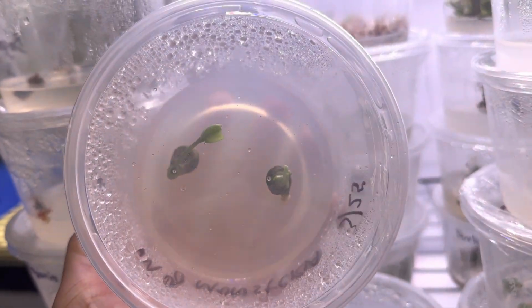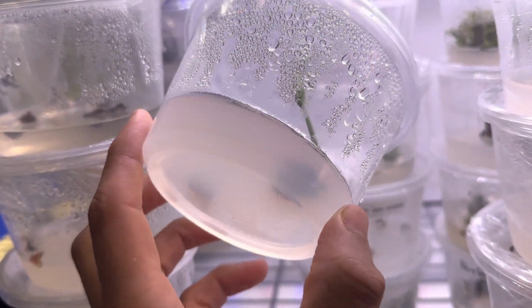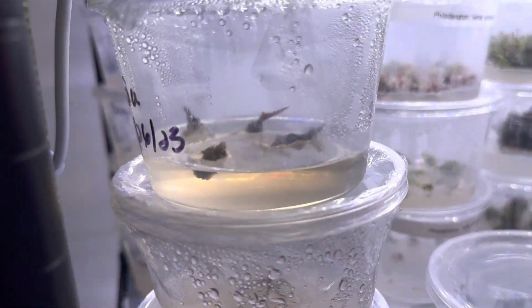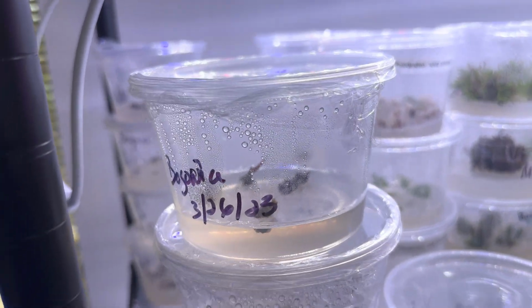You can see how good this looks. It has two plants. Both plants are looking great, and there is no contamination. So this is something that I'm going to be showing you as part of the class. We're going to be sterilizing multiple plants, houseplants obviously. We're going to place them in tissue culture.